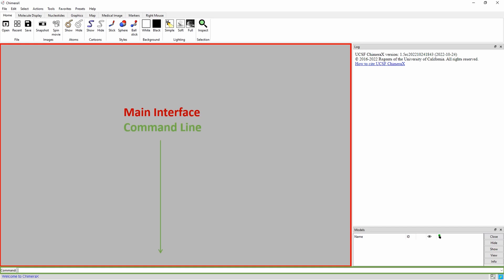The command line, highlighted in green, allows commands to be typed rather than clicking buttons in the menus. The command line allows you to alter the default parameters used by the buttons, giving you more control. You can learn more about how a command works by typing help and the name of the command. This will bring up a page with information about the command and how to run it.